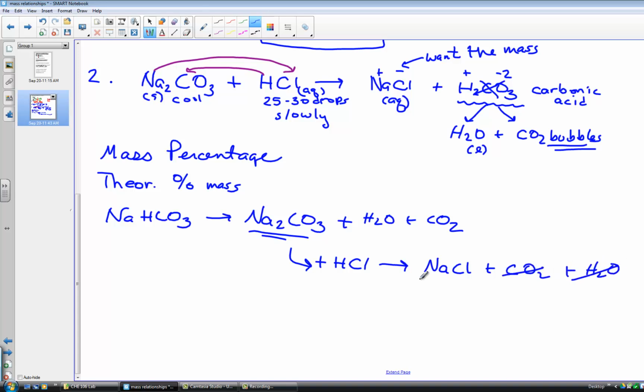We got rid of these, and this is the mass. Alrighty. What we'd like to know is the mass percent of the sodium salt we produced compared to the original mass of the salt. And let's take some practice data, and that would be a good place to start here. Just so we have some common numbers, we'll go to the advanced study assignment next.